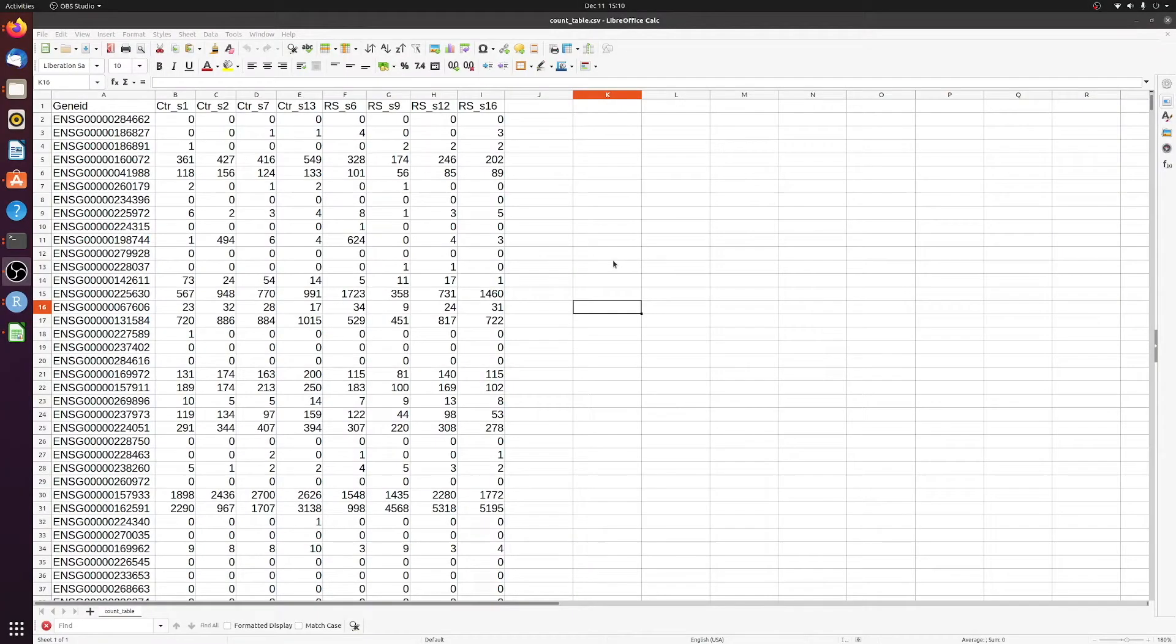Okay, so we're going to do a relatively straightforward and simple differential expression analysis, and here I'm just showing the counts table.